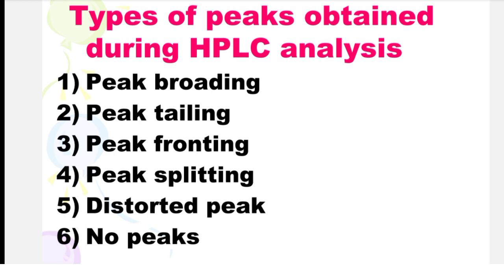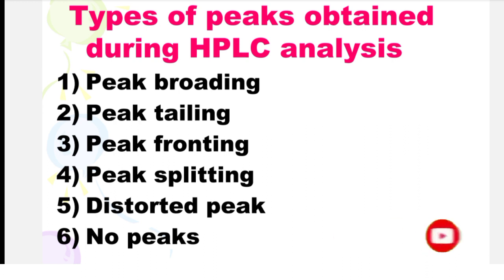Friends, if you are regularly working on HPLC, then you have observed such types of peak shape issues: peak broadening, peak tailing, peak fronting, peak splitting, distorted peak, and no peaks. Let's discuss one by one.